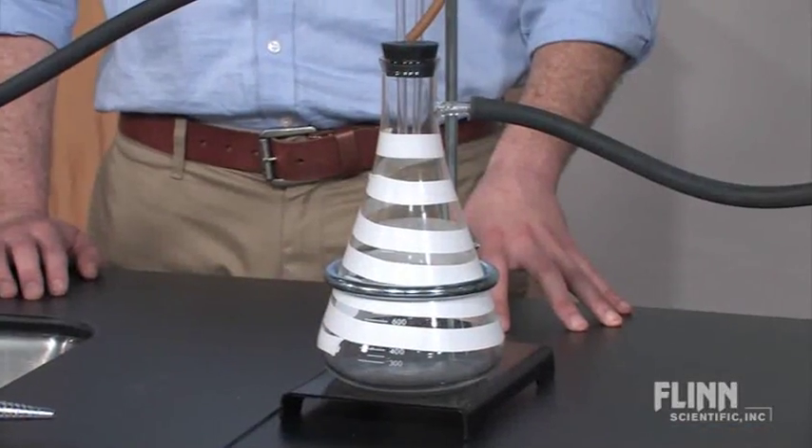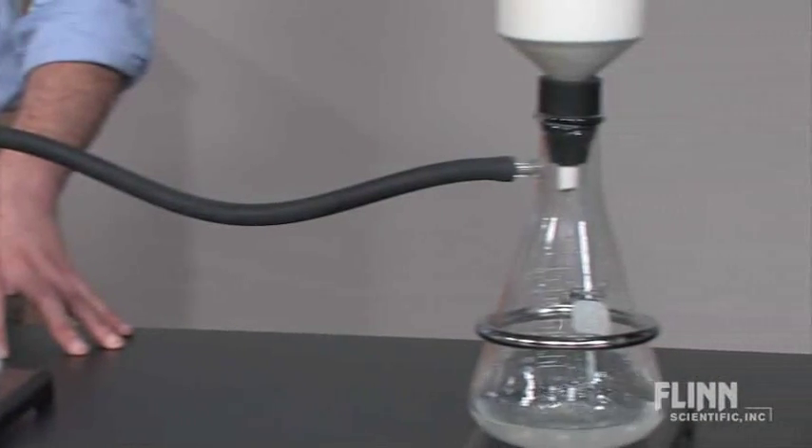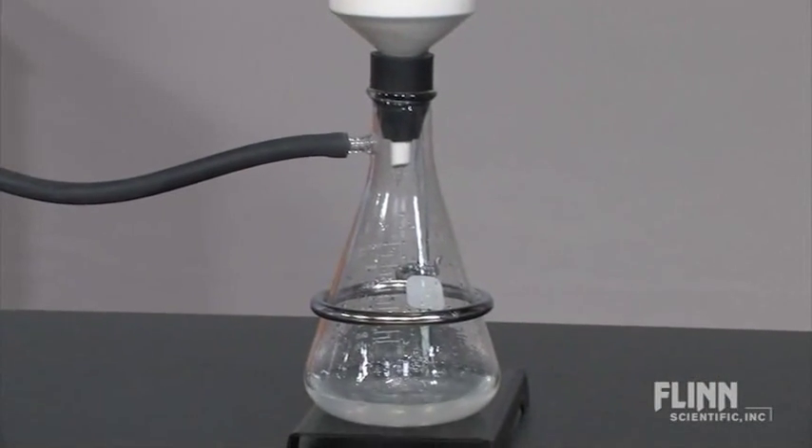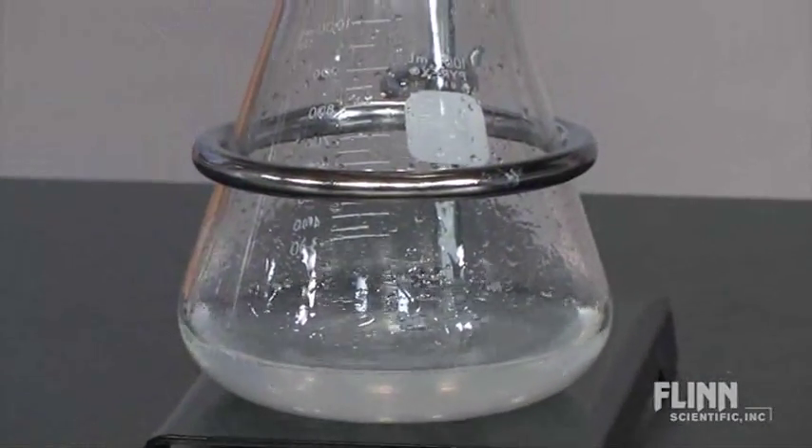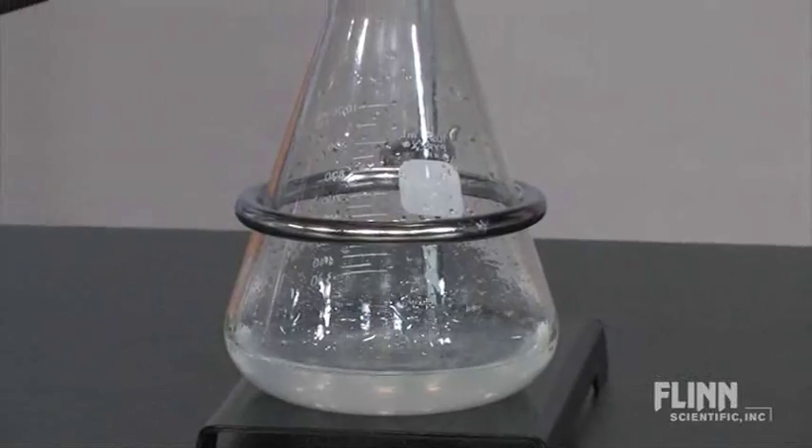As water rushes past the sidearm aperture, a partial vacuum of about 10 millimeters mercury, or 10 torr, is formed. This is enough pressure to significantly speed up vacuum filtrations to accommodate short lab periods.